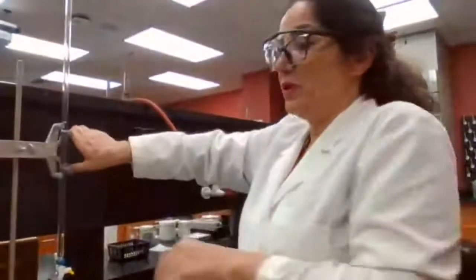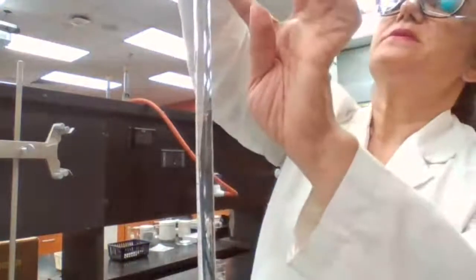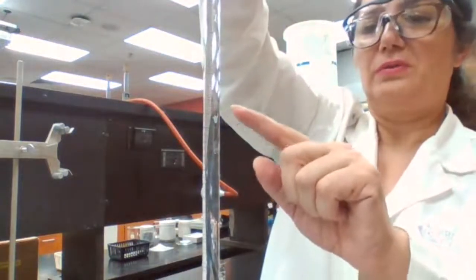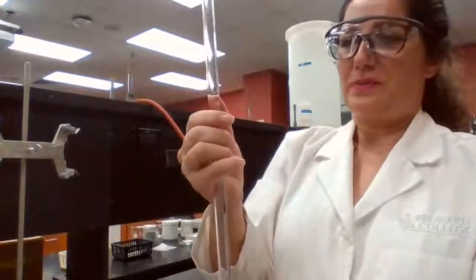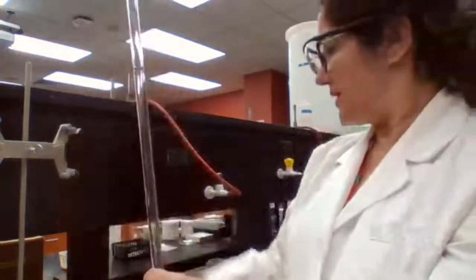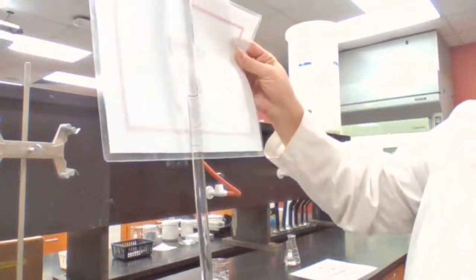Station 3 is a burette. A burette is more accurate than a graduated cylinder. It is graduated from 0 on top to 50 milliliter all the way down here. The numbers are shown, and between the numbers you have the lines. Each line shows 0.1, so you can interpolate and get the second decimal place when measuring with the burette. When you measure with a burette, you're not saying how much liquid you have in here, you're just saying which number the liquid is across. So it's called a burette reading, not volume. It's easier if you place colored paper or white paper behind it. You see, it's much easier to see. That's why we sometimes use paper behind the lines, so you can see the meniscus, the lowest point.